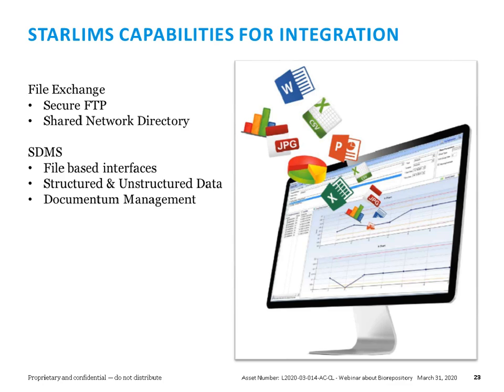And so another important thing is the capability for integration. As you can see, when it comes to the LIMS for biorepository, it's not just going to be the LIMS. As I showed at the beginning of the presentation, the sample data will be dispersed in multiple IT systems. So the LIMS is just going to be one of them. And having capabilities for integration of the LIMS with other external systems, or perhaps automated storage systems, instruments, shipping carriers, anything, is very important.